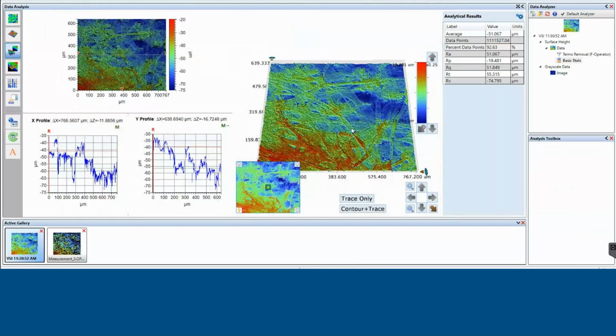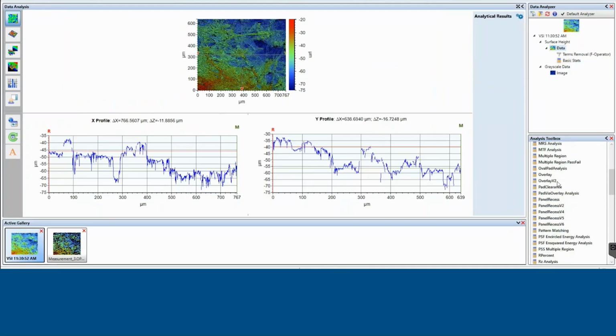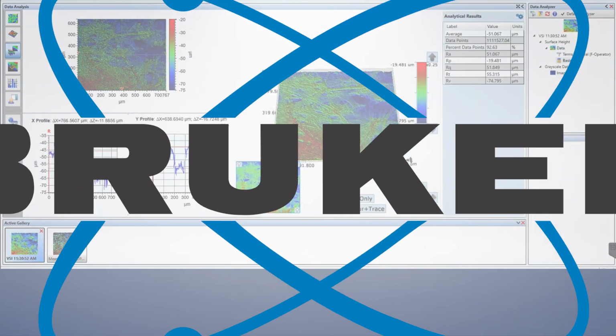So this is where any difficult to measure samples are already becoming accessible to us at the raw data stage. And this will also help repeatability. If you are currently measuring these samples and you have to do a ton of analysis on top of your raw data to get good spatial features, you would want to be staying closer to the raw data in this case and then get good measurements.